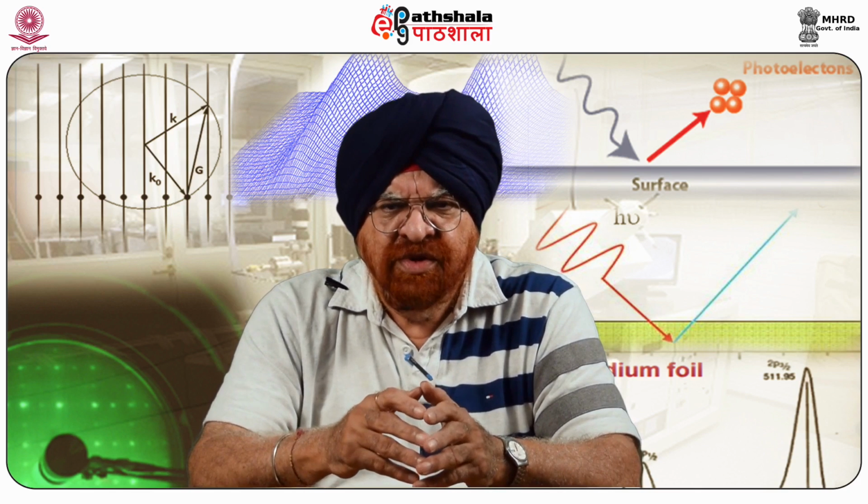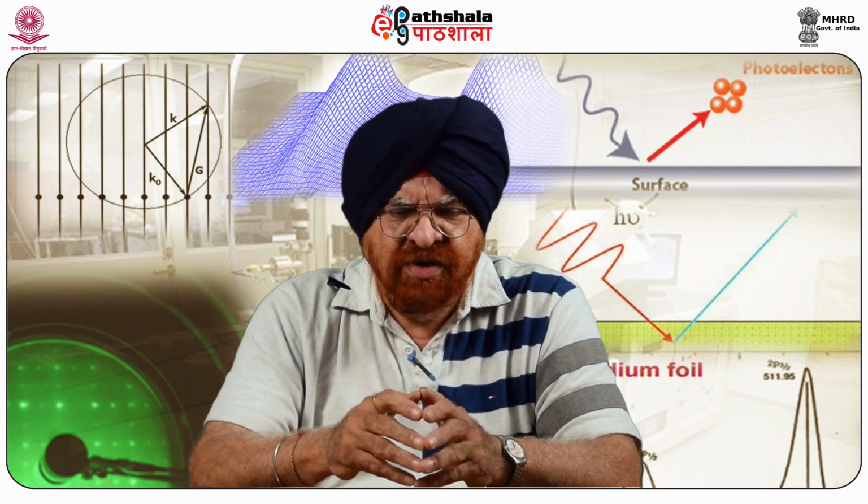Elemental identification and quantification of any element from lithium to uranium can be done using ESCA. I had said that the usefulness of this spectroscopy is that it can detect elements from very light ones like lithium to very heavy elements like uranium with great ease. Sensitivity also is of a very high order.